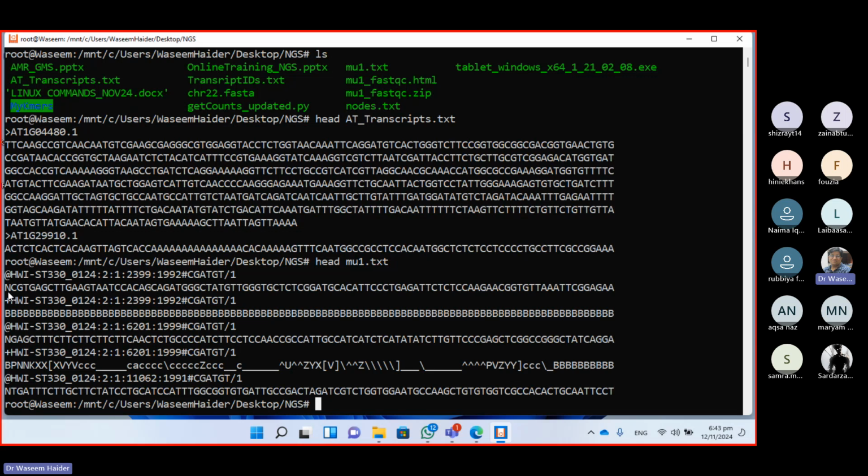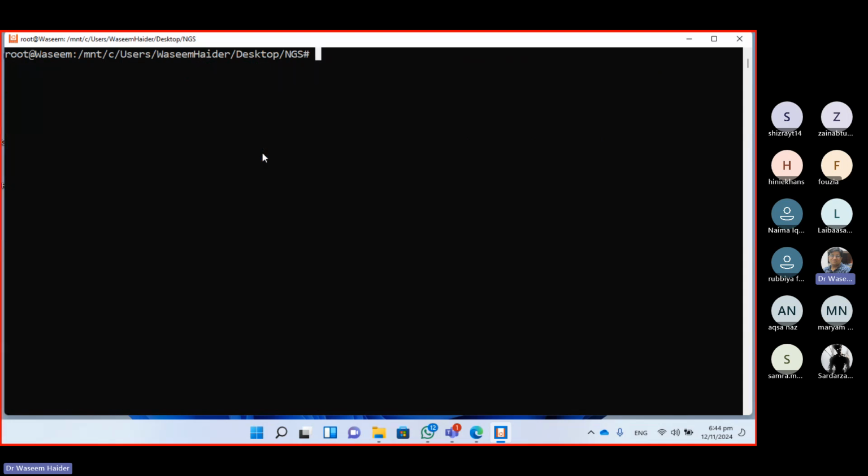So all we need to do is take that read and map it wherever it's mapping or aligning. Obviously these are all 100 nucleotides, and they must be matching. You are allowed only 2 or 3 mismatches, not more than that. Here we are not doing the local alignment or global alignment which we covered in our bioinformatics class. This is the thing we did in pattern matching, where you must have exactly the same thing, right?